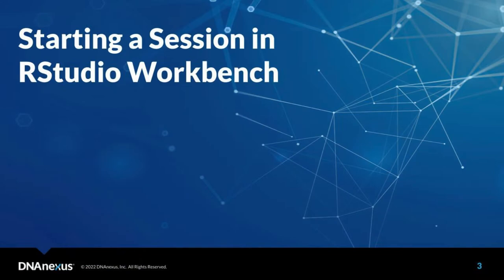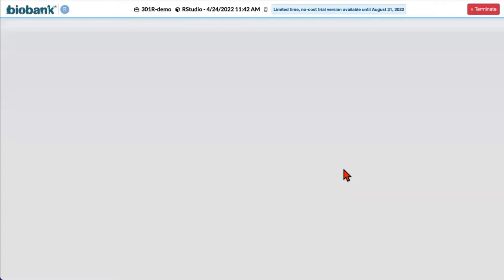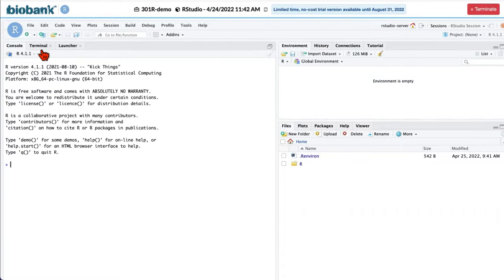In order to create new session, click on new session and then click on start session. We can now work in RStudio. Let us start working first in the terminal.